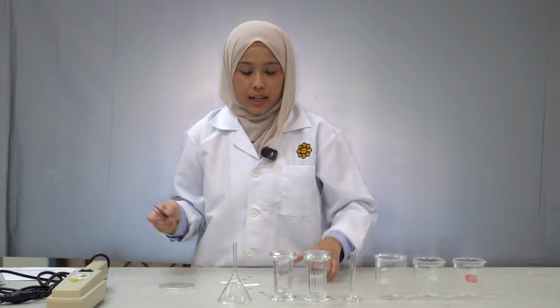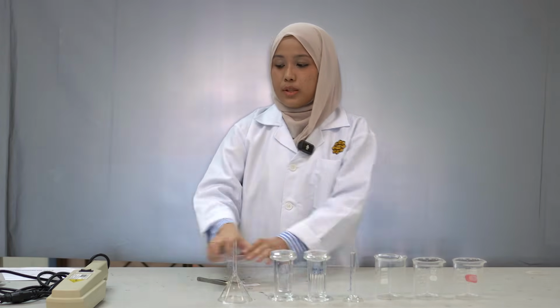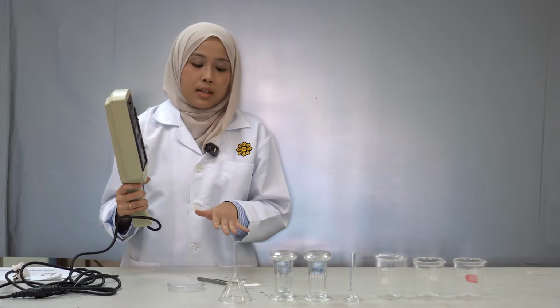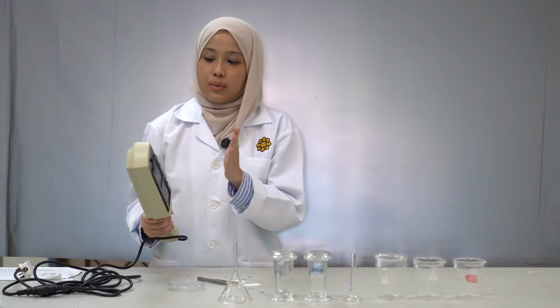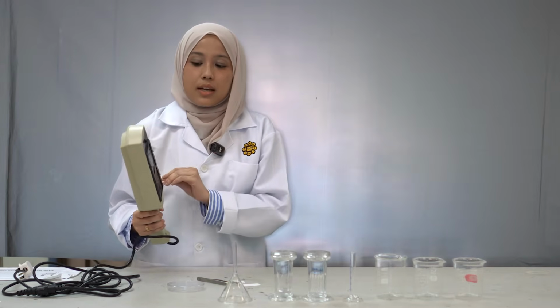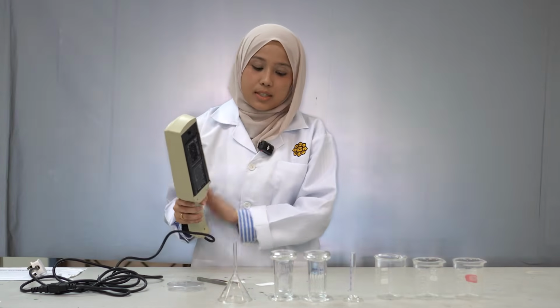After it has dried, we cannot see the sample that went up with the solvent with our naked eyes. So how do we visualize it? We will use this UV lamp, the short wavelength one, and we will cover it with plastic paper, because the wavelength is dangerous, so it cannot touch our skin.